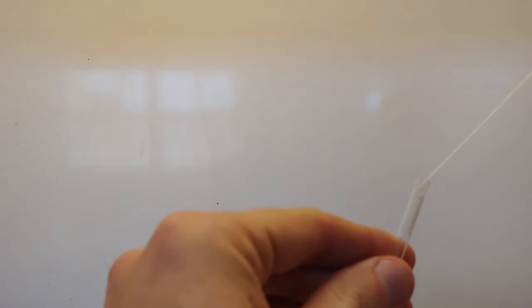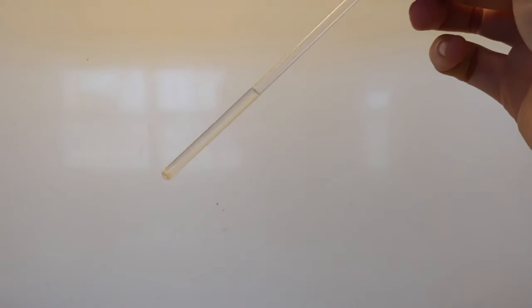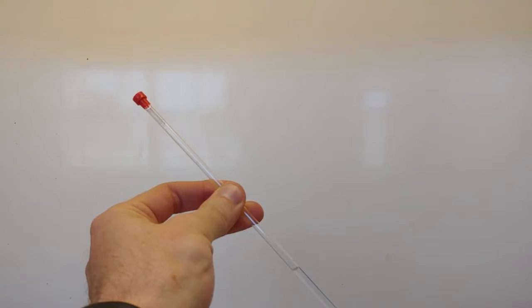If we use protic solvent we just see a big solvent signal and we wouldn't actually see any of our sample. We're putting the solvent in the tube now and then just making sure that all of our sample is fully dissolved and then we put a cap on the tube like that and the sample is now ready to run.